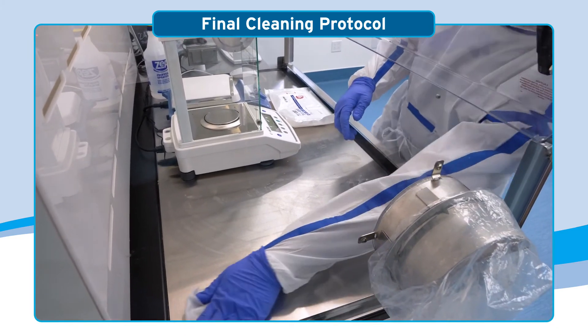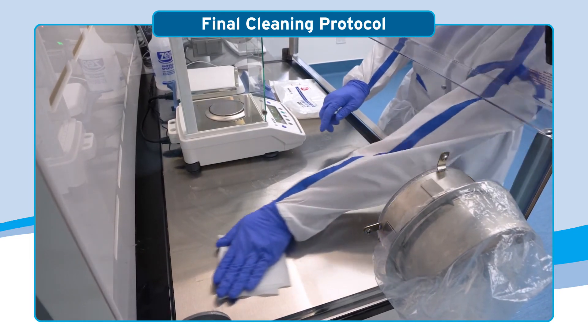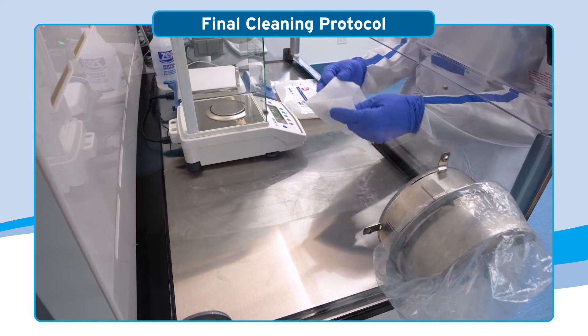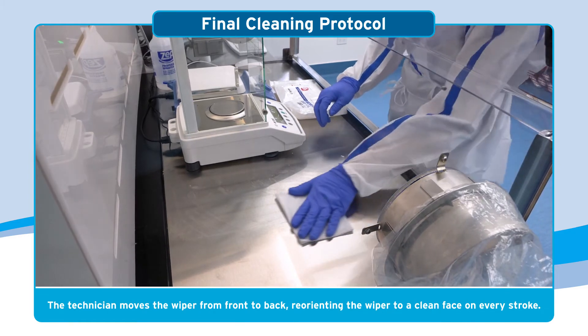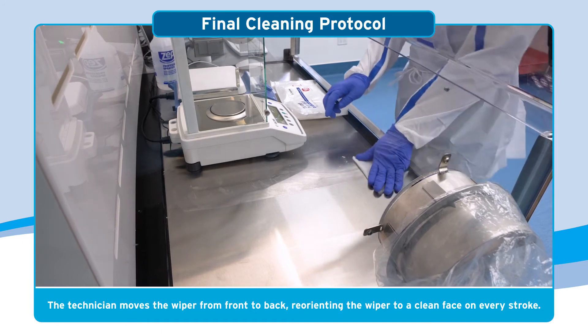Properly cleaning a negative pressure CVE involves sweeping particulate into the airflow. The cleaning procedure will create airborne particulates. The CVE's laminar airflow moves from front to back, so the technician also moves the wiper from front to back, reorienting the wiper to a clean face on every stroke.